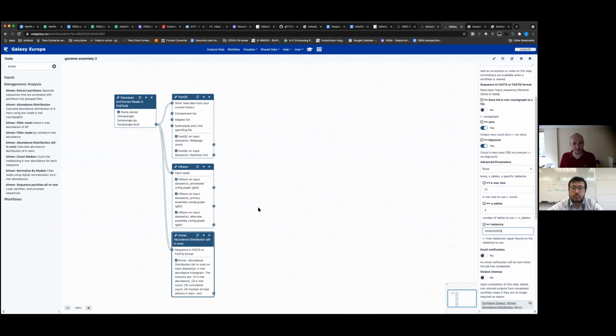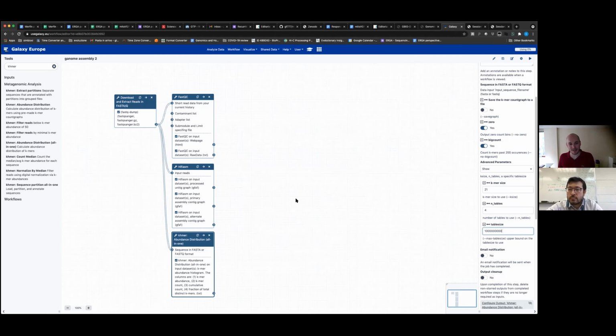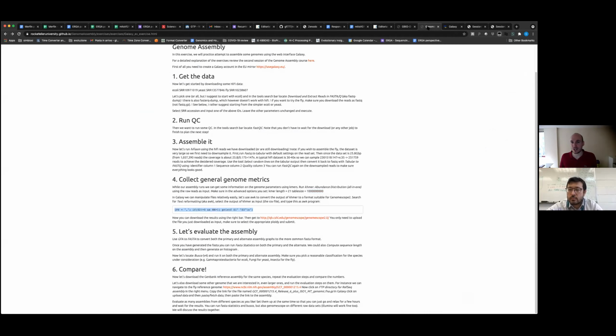And then we have this little step here that, if you're not familiar with AWK, may sound very exotic. Who among you knows how to read this? It's not that complicated actually, but you need to know what AWK is. Anyone?